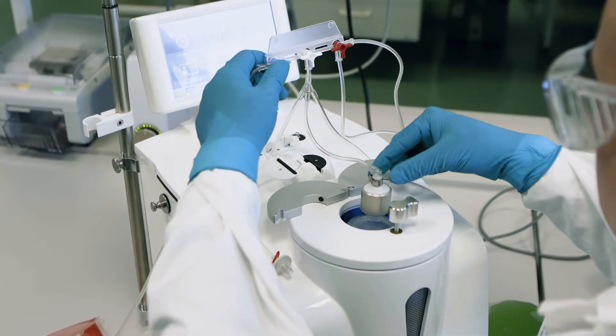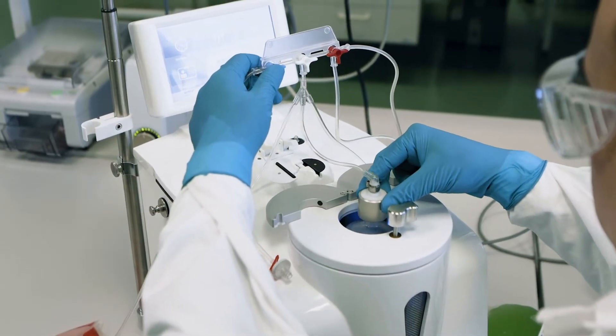Hello, my name is Zach Nelson, and I'm an application specialist with Cytiva. In this role, I offer technical guidance to help our customers implement Cytiva's cell and gene therapy solutions. Today, we'll take a closer look at the BeadWash CPRO application software, designed for use with the CPAC CPRO cell processing device.